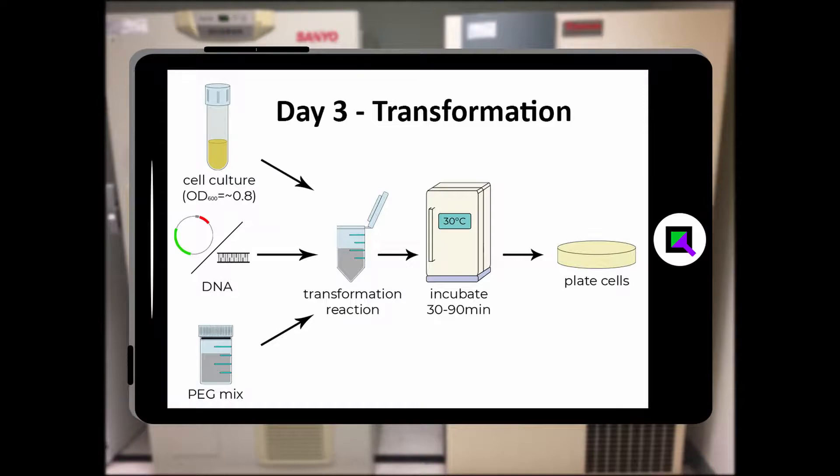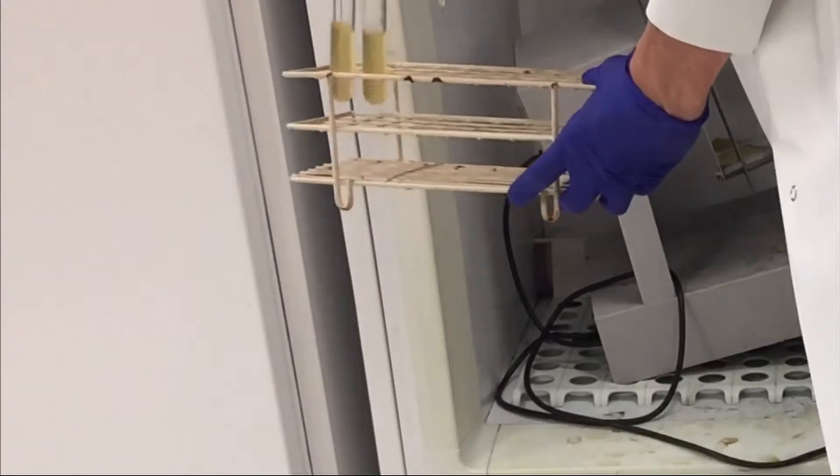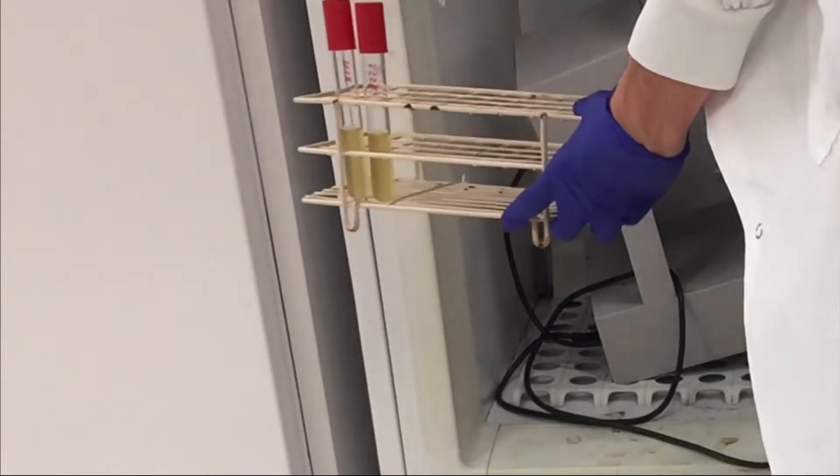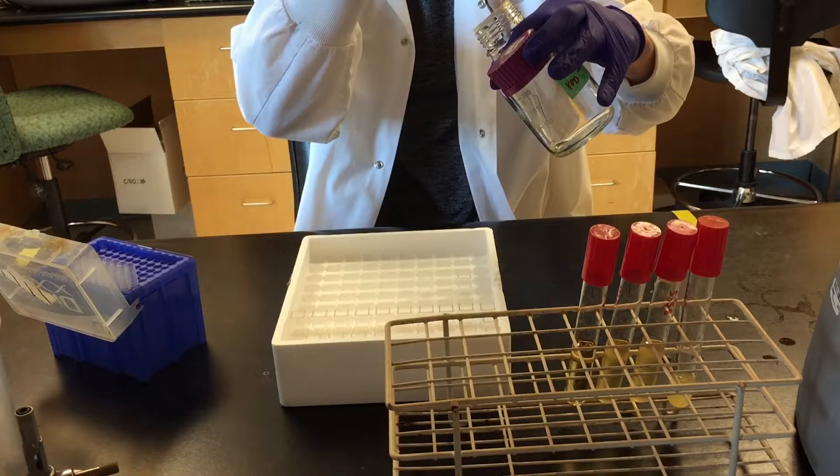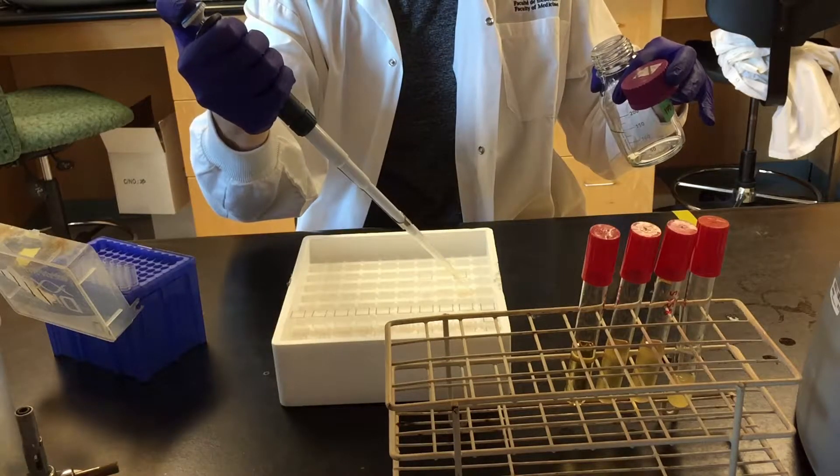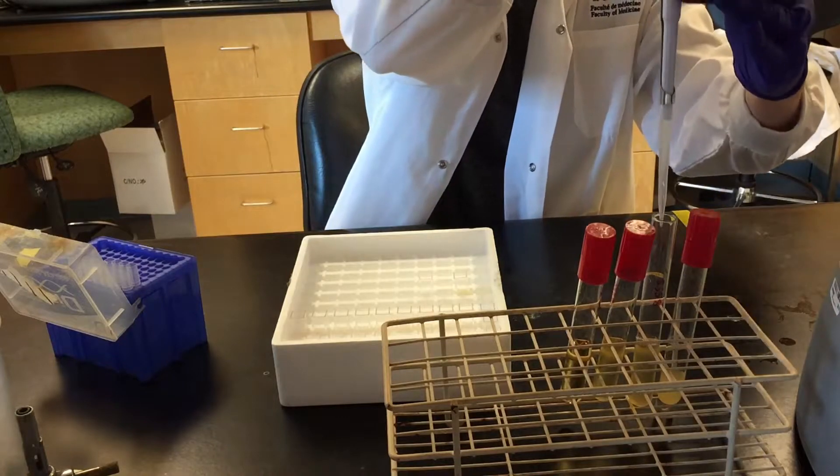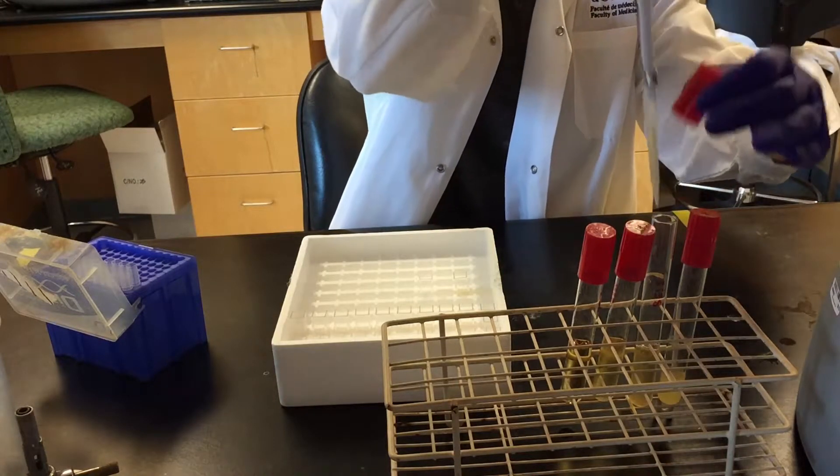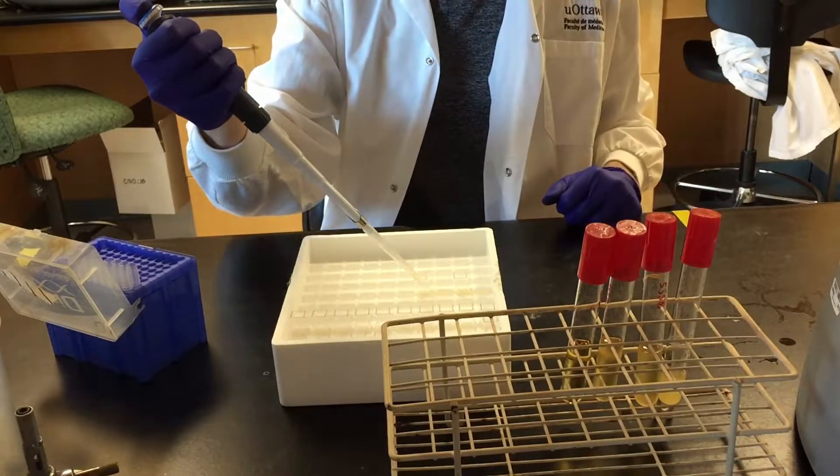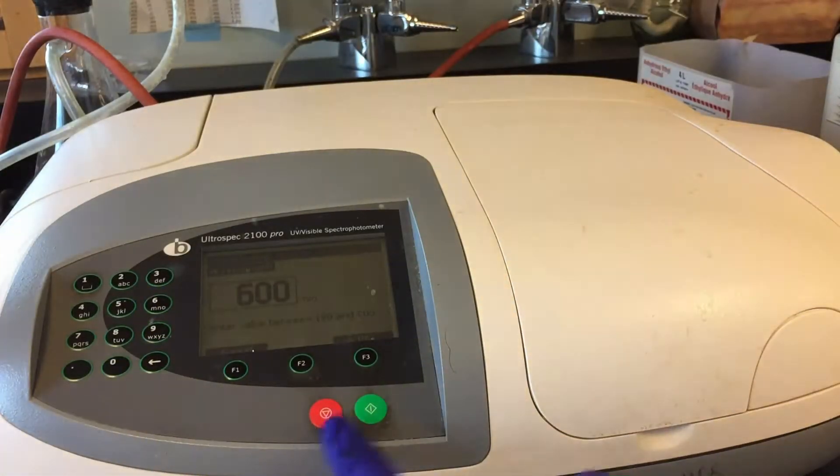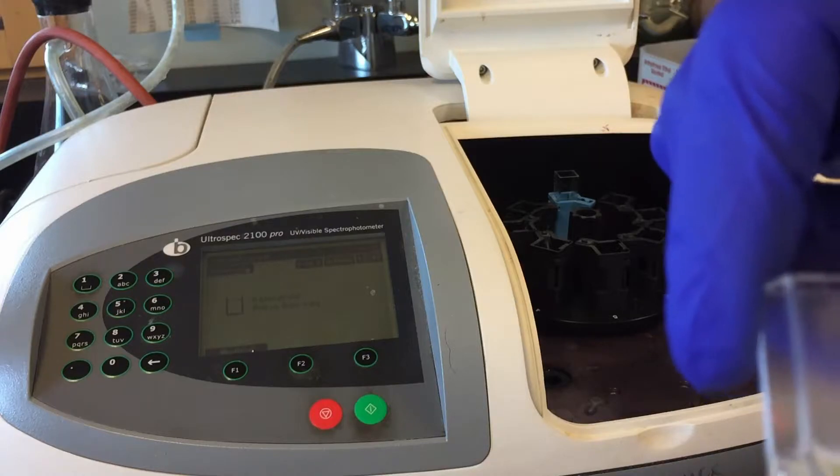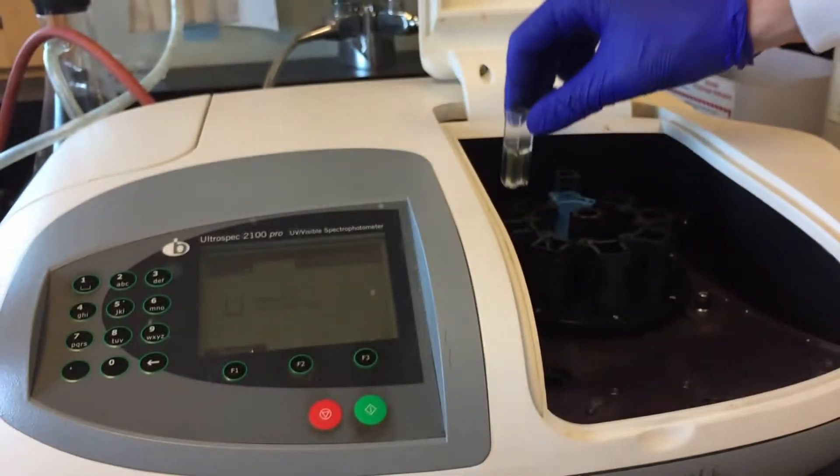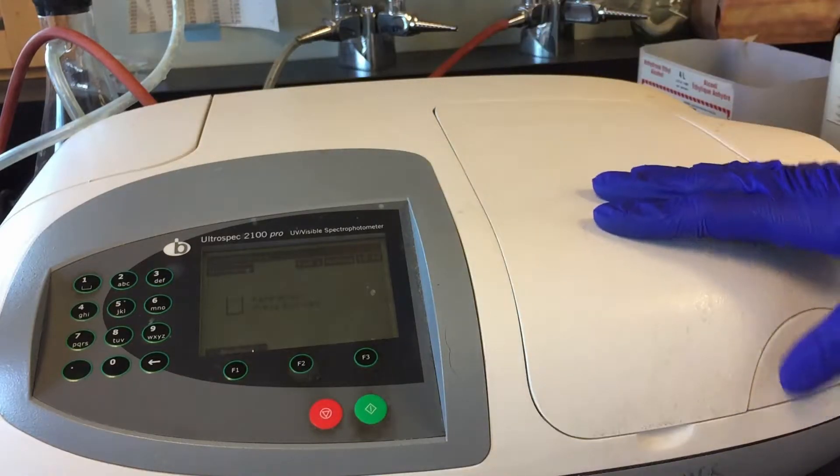Day three, transformation. Take the liquid cultures out of the incubator. Measure the OD of cultures that are not obviously saturated. An OD 600 value of 0.6 to 0.8 is ideal for exponentially growing cultures.